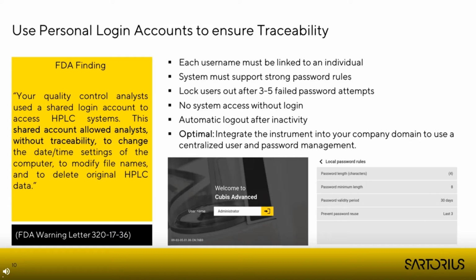Especially with an essential laboratory instrument, such as a balance or a pH meter, which is present several times in the laboratory, a central administration of the users is very helpful, so that the users do not have to manage on each instrument. In the optimal case, this is a direct integration of the instrument into the corporate domain or Active Directory, without any additional software in between.